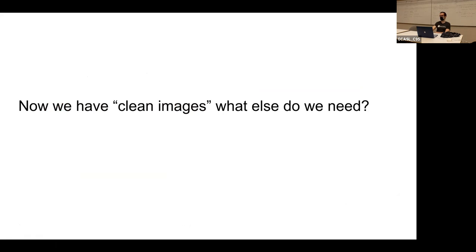What else do we need to actually train the network? The actual images, right? Remember that the network is trained to map noisy images to clean images. So we need noisy images. Do you simulate those too? That was my next question. We just simulate the noise. I wasn't sure if you instead took a lot of noisy images. Then I guess it would be hard to make them line up exactly, and we don't know what's underneath. So that's the problem. We wouldn't know how to match them.